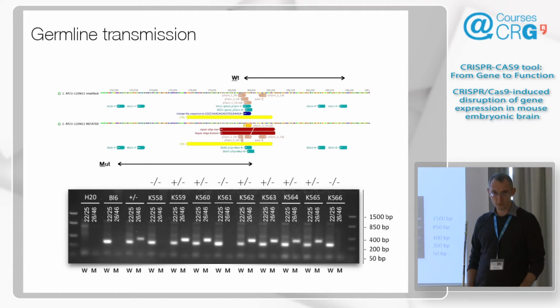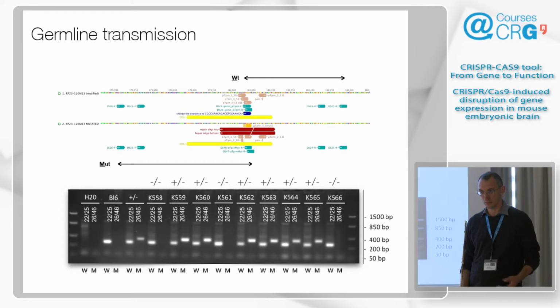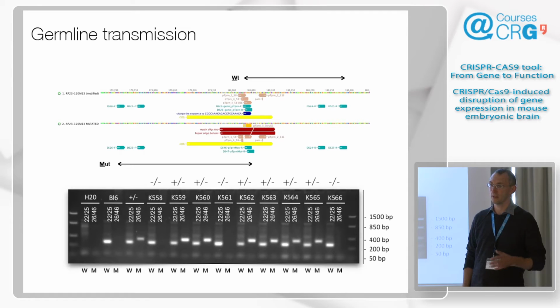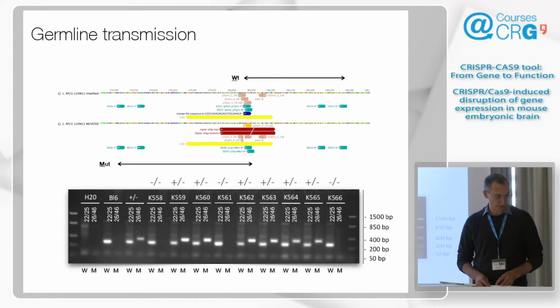I don't have the data for that, but basically in none of the experiments, and we are already in hundreds of injections, probably not 1,000 yet, but hundreds of injections for sure, and none of the mice we made, we haven't yet met mice that didn't transmit. So everything has been transmitting very nicely.